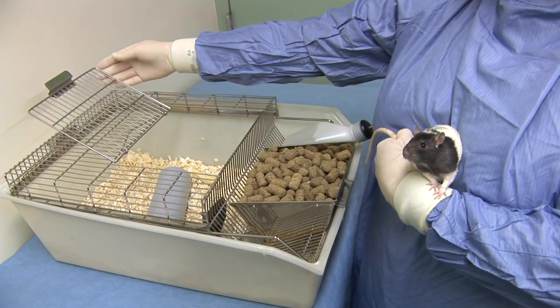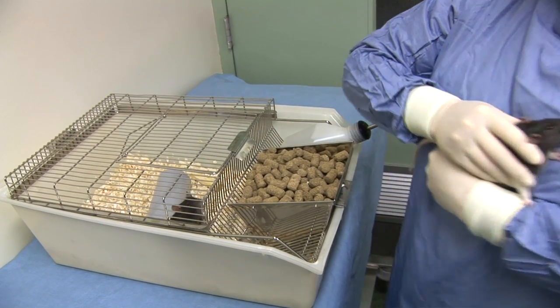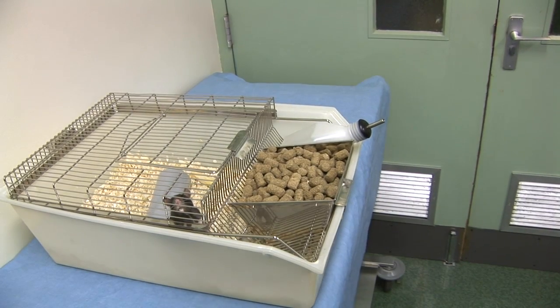The cage lid may need to be replaced to avoid the other animals climbing out of the cage. Two methods of subcutaneous injection will be demonstrated.